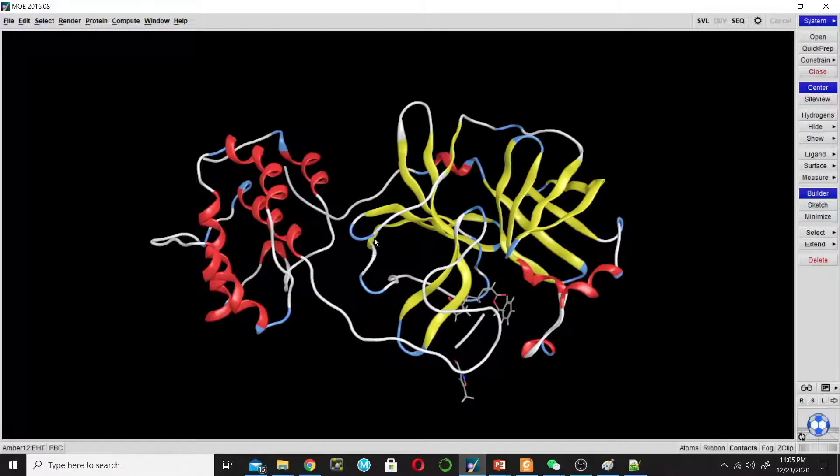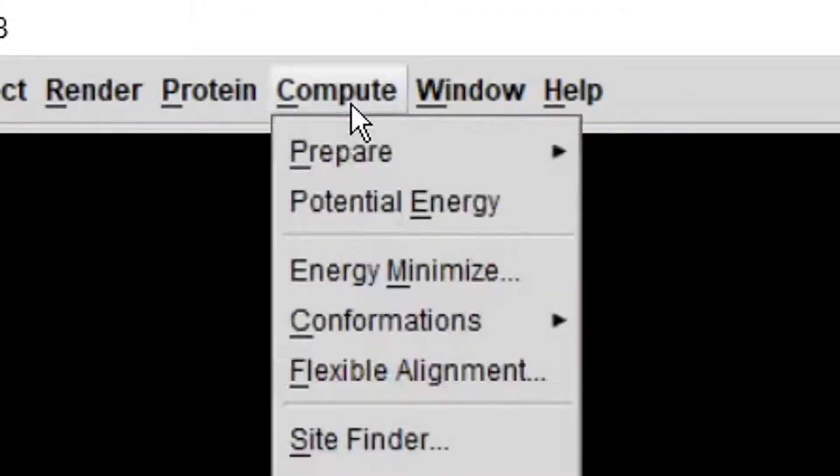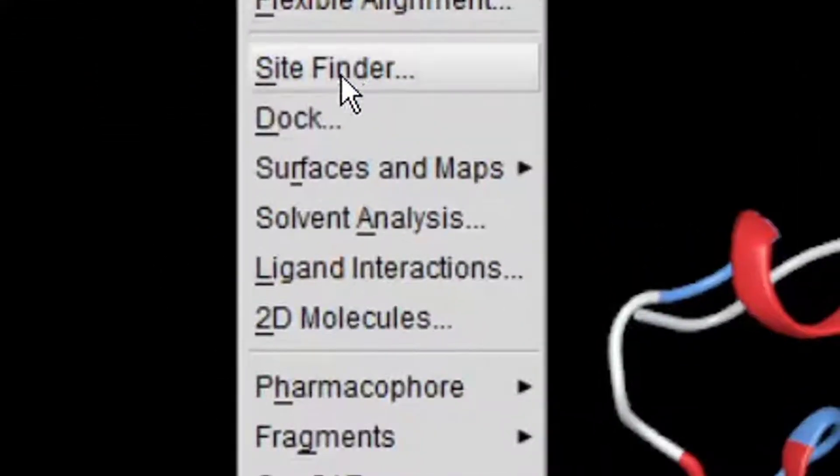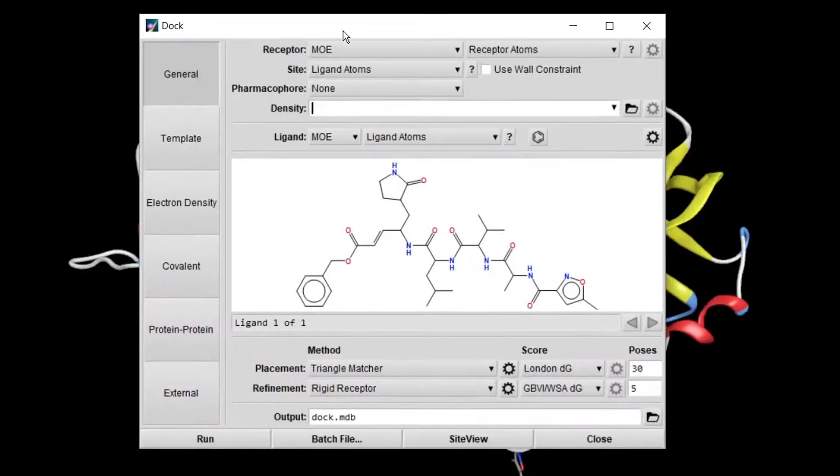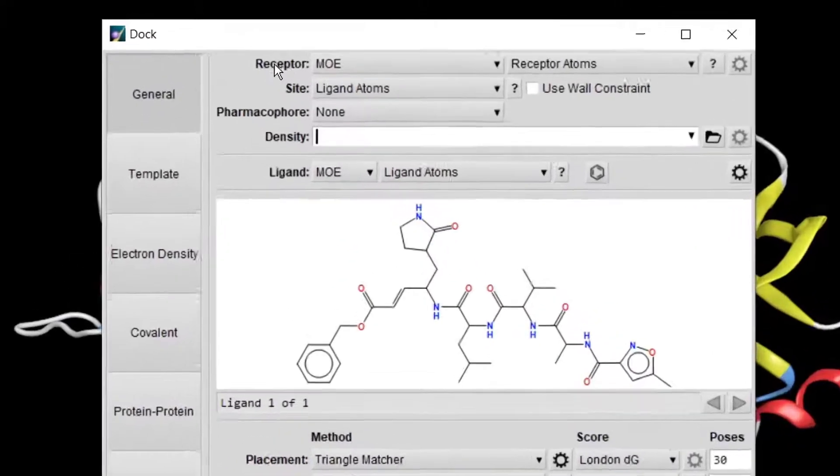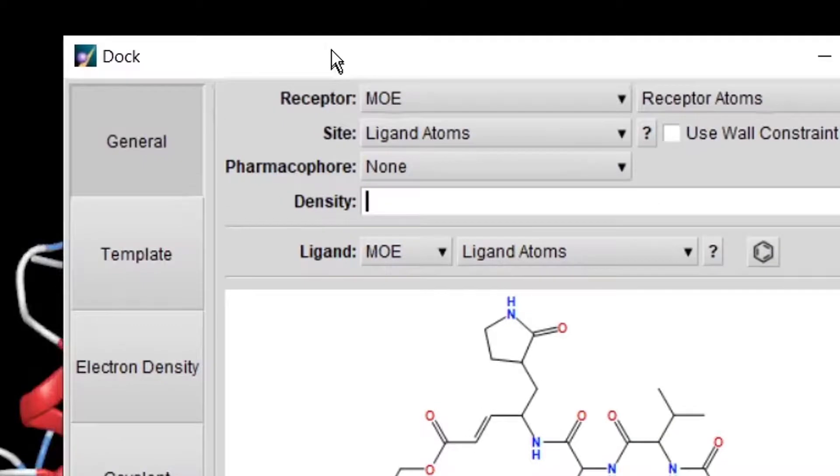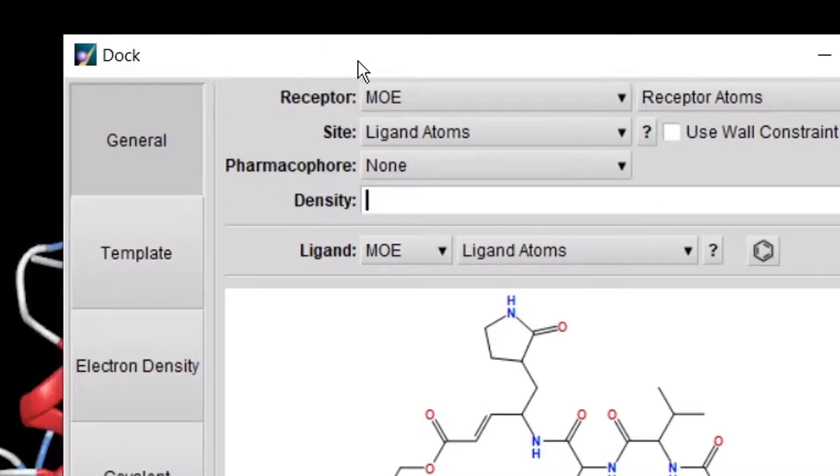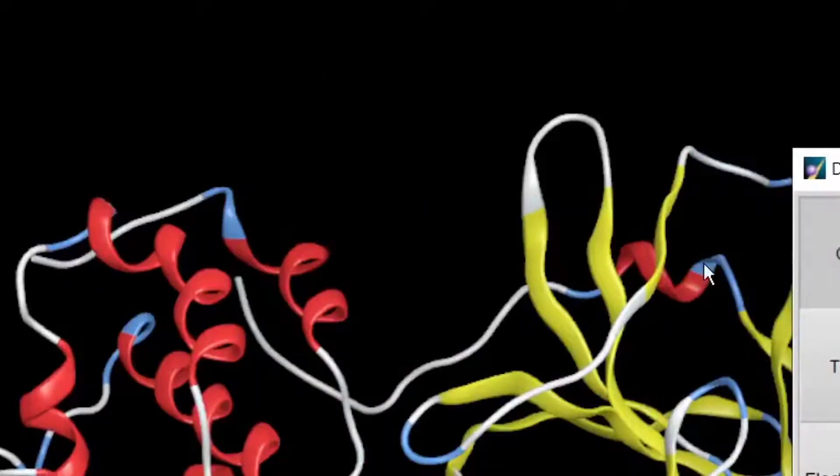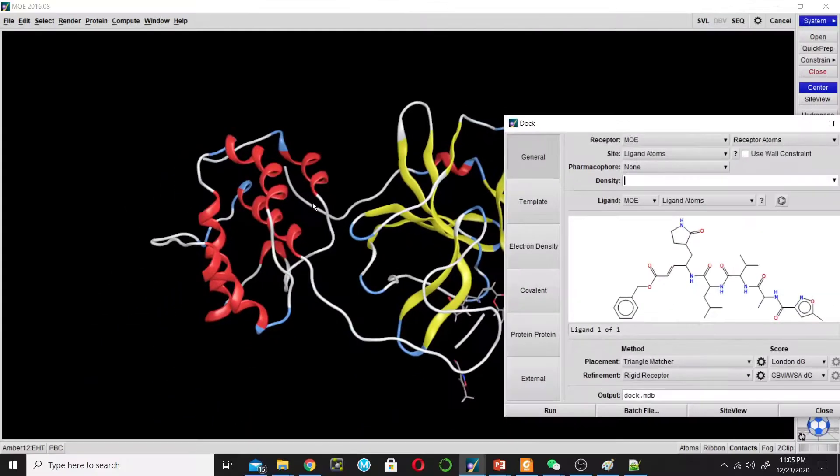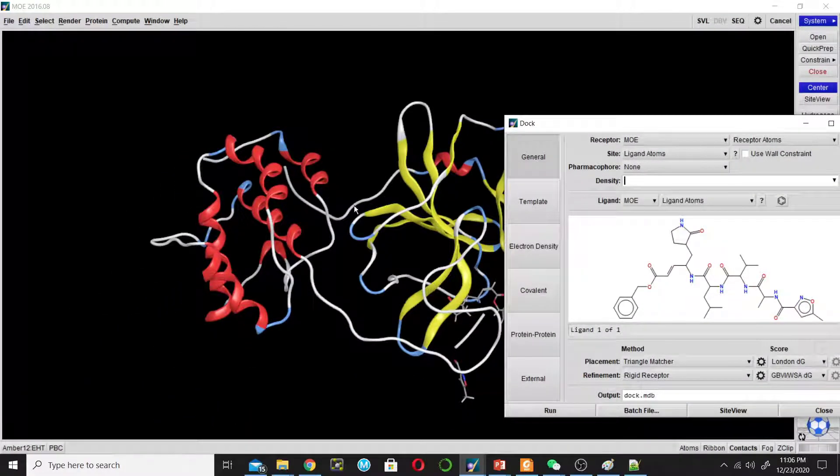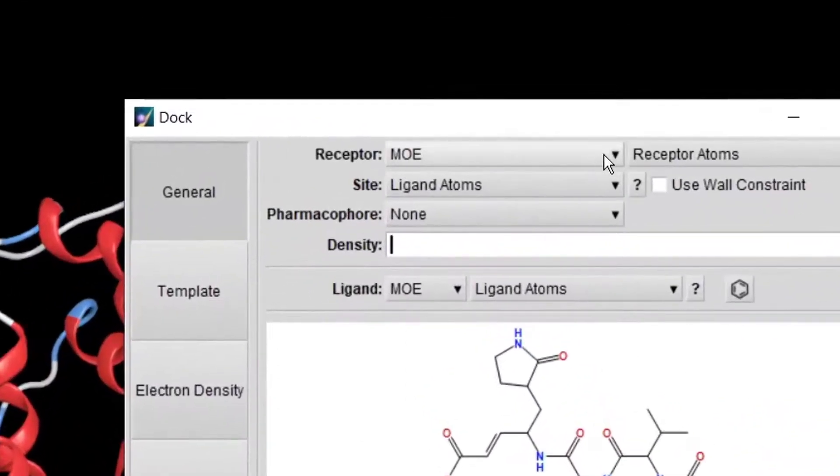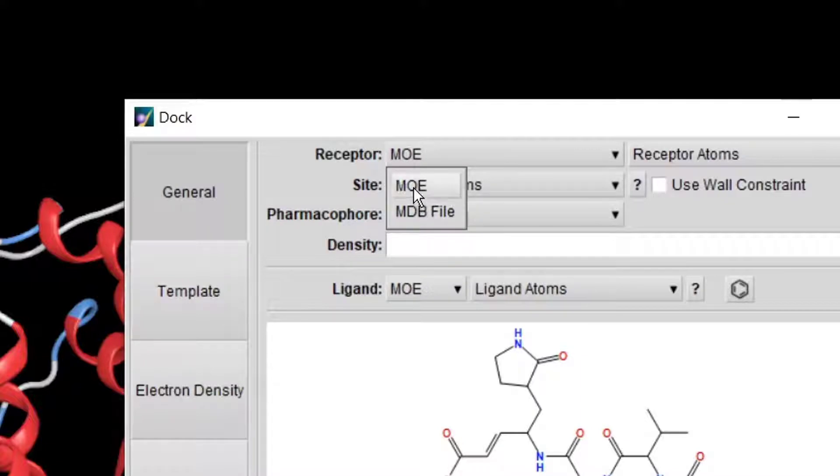To do the docking, go to Compute and click on Dock. This opens the docking window. For the receptor, we have the MOE window containing the enzyme 3CL4, so we will tell MOE to use this enzyme as a receptor. There are two options available here, so we will choose MOE.